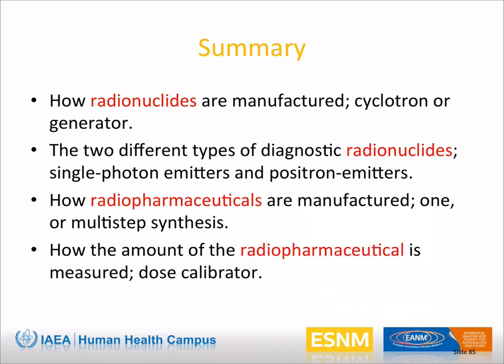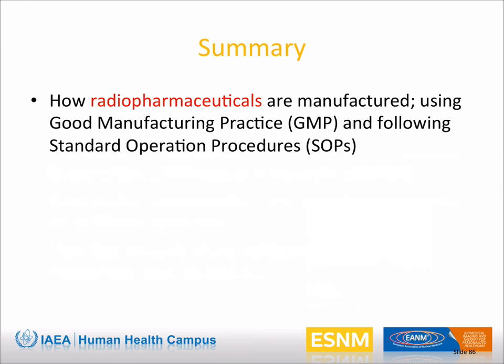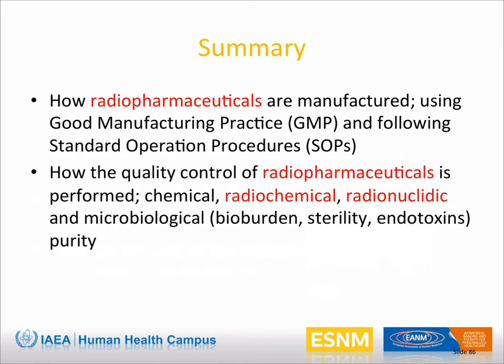How the amount of the radiopharmaceutical is measured, in a dose calibrator. How radiopharmaceuticals are manufactured, using good manufacturing practice, GMP, and following standard operating procedures, SOPs.